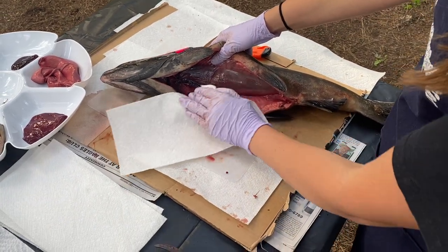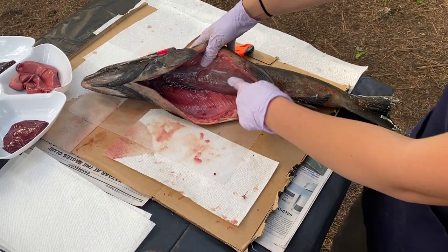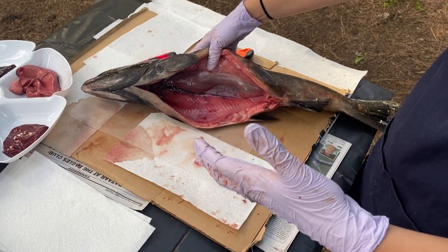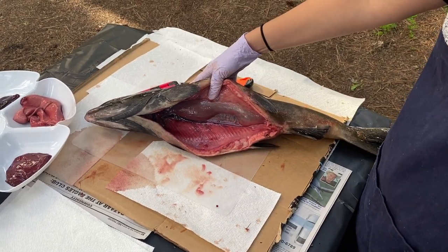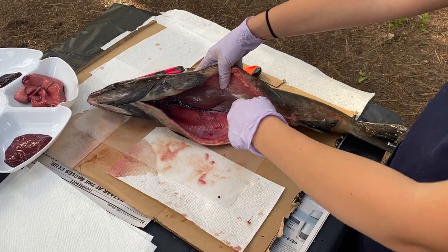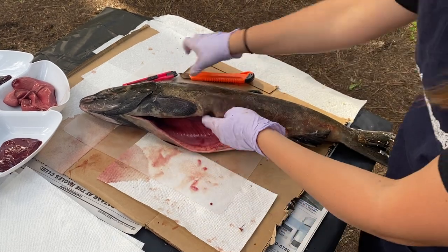So if there is a salmon and you want to swim to the top to get a really nice tasty fly, you're going to inflate your swim bladder as you go up so you have more air and it's easier to go to the surface. And then if there's something scary that's going to get you, like a bird, you're going to swim all the way down and your swim bladder is going to lose air, and that way you can swim fast into the deep ends of the water.